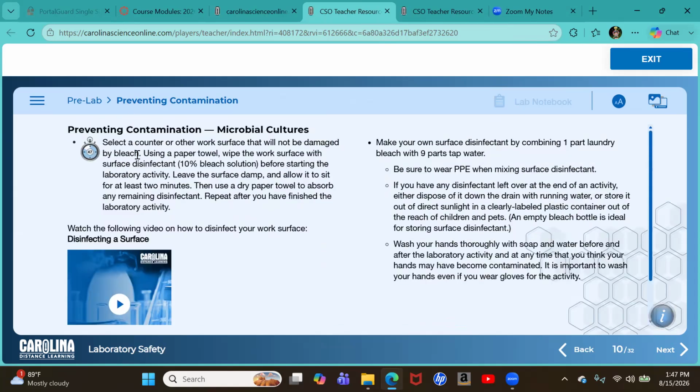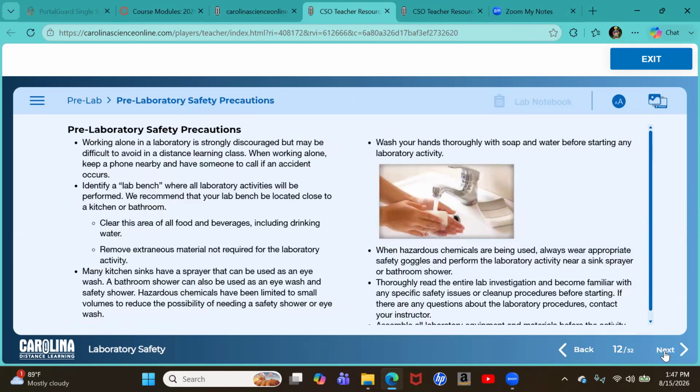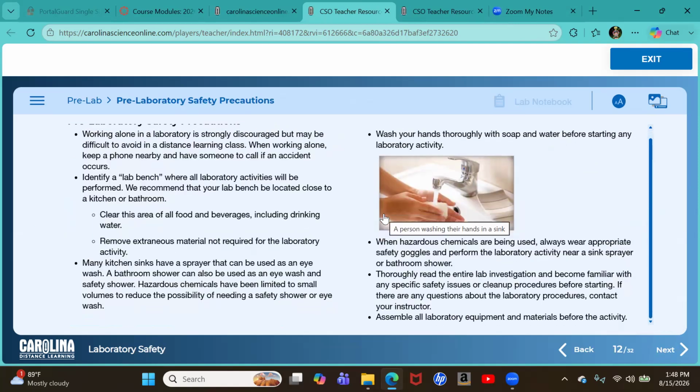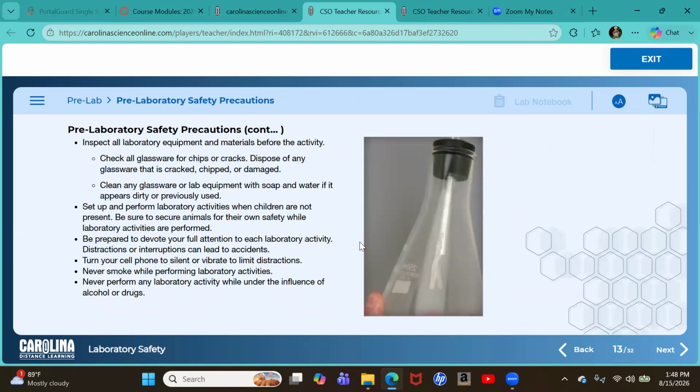Before you do your wet labs, make sure you have a smooth table or surface where you can clean it. Make sure you wipe it down with soap and water. We aren't using biological cultures in this particular course or petri dishes, so there's no real risk here for contamination. So we're not going to go into this microbial culture where you might contaminate your specimen. But as always, make sure your area is clean of food and beverages. Make sure you wash your hands.